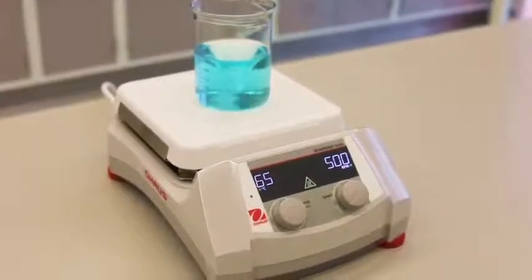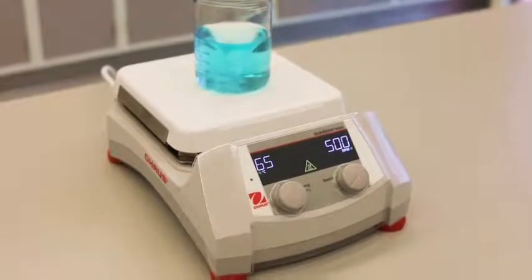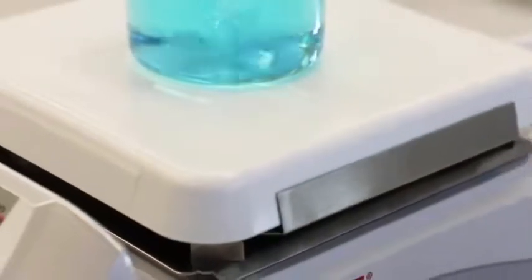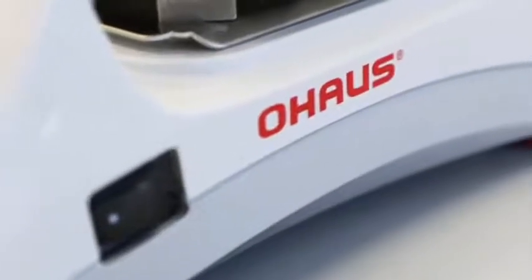21st century laboratory equipment needs to be affordable, durable, and offer the highest levels of safety. OHAUS Guardian 5000 series hot plate stirrers are designed for safety and simplicity in all academia, research, and industrial applications.